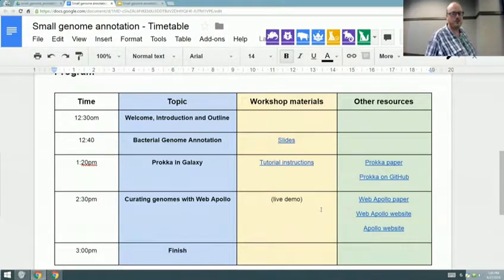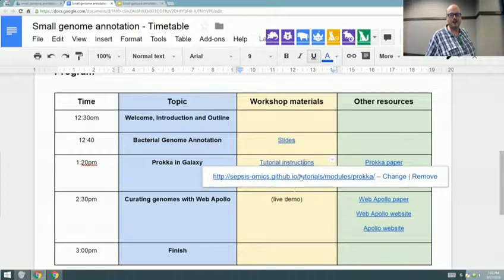All right, we're going to do the tutorial now. The tutorial instructions are off this page here.